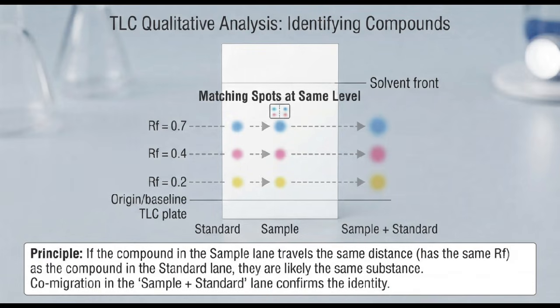Interpretation. TLC can be used to compare a sample with a reference standard, monitor chemical reactions, detect impurities, and assess the presence of different components. When comparing compounds, the RF value should always be considered under the same chromatographic conditions because changes in the stationary phase, mobile phase, chamber condition, or other parameters can affect migration.